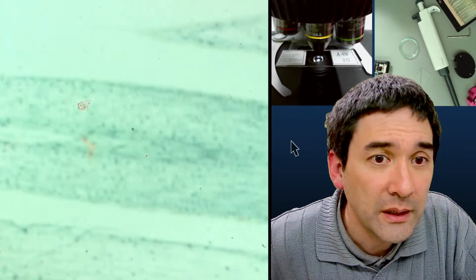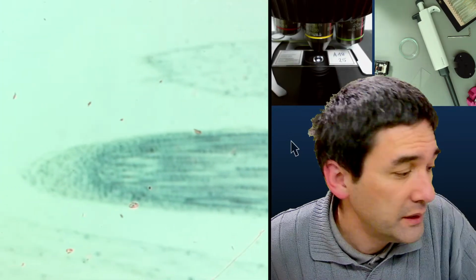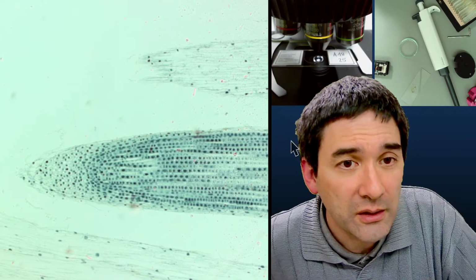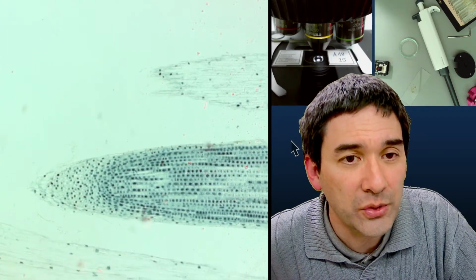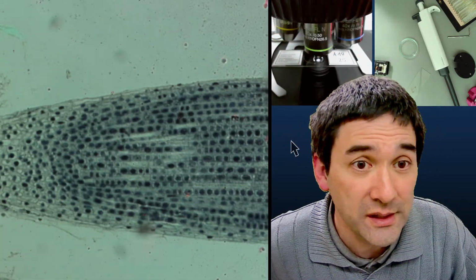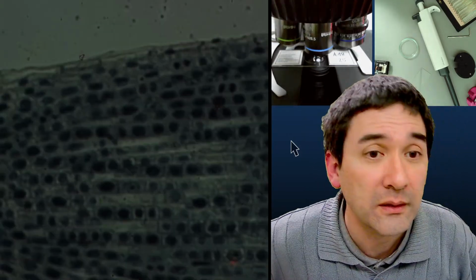So these are now onion cells. Where's this? I have to find it. And it's way too bright. Okay, here are some onion cells. Okay, here we go. It's totally out of focus. Okay, and these are stained. It doesn't say how they were stained. This is a commercially prepared onion slide so that you are able to see chromosomes. That's the whole point of this. Okay, and go 40 times.